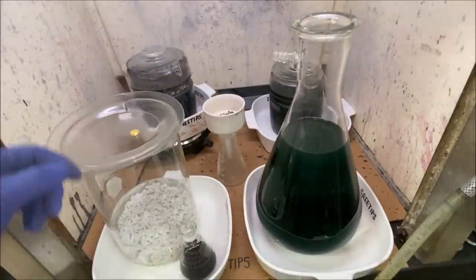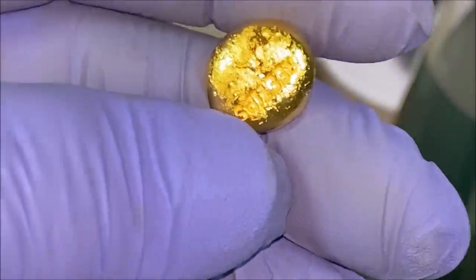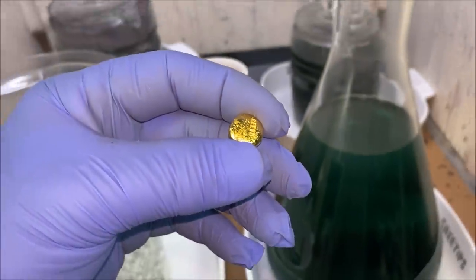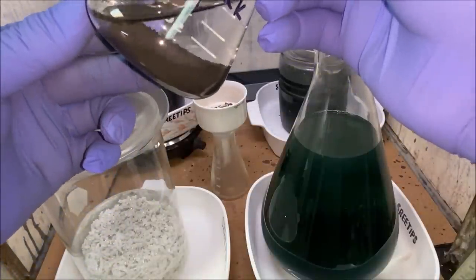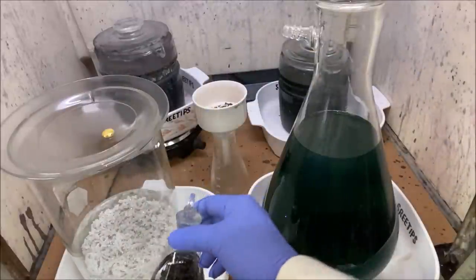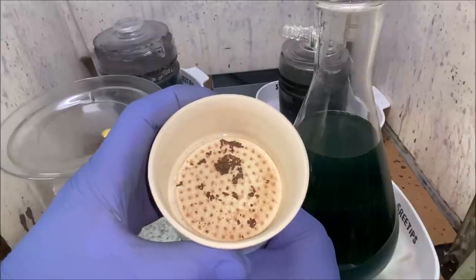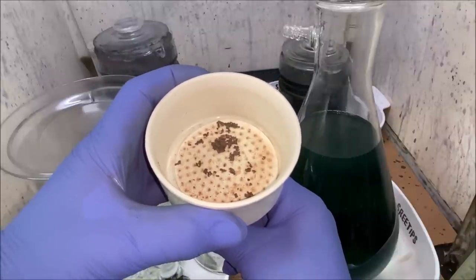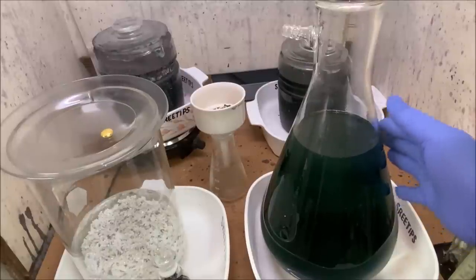Here are all the products of this silver cell anode filter recovery refining. Here's our little button of gold — it's got my name stamped on it, it's about nine grams, and we'll offer that up for sale. We've got the platinum group metals here in this container — probably two or three grams worth of mixed black platinum group metals, mostly palladium with a little platinum. The chunks in this filter from part seven — someone's saying that might be some other platinum group metals like iridium and rhodium, so we'll hang on to those. And then I've got a whole bunch of silver that we dissolved out of those filters, in this container here.